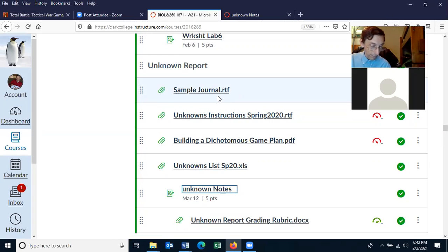We decided that because this is all going to be done online, you're not going to be coming into the lab to do any of it, that we decided not to give you a mixed culture where you would be streaking it out and then isolating one species and then doing a report on one species. We're going to send you just one species, and you're going to try and identify what that one species is.